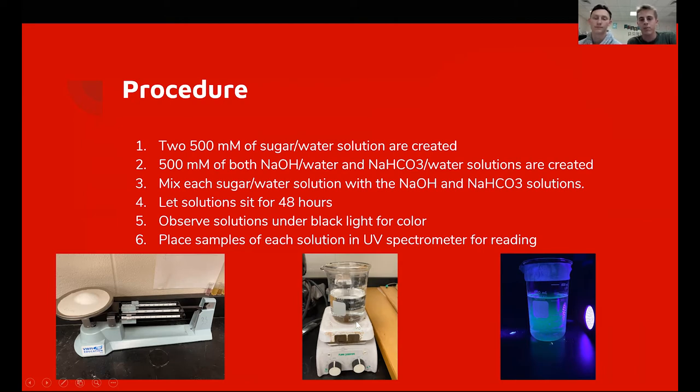And then we place each of these in 200 milliliters of water, and we mix them up to get a nice pure solution. And then we'll mix the two together, and then once we let it sit for 48 hours, you can see here when we shine a black light on it, it gives off a greenish tint. So based on the slide before, that means that this tint is showing a lower size quantum dot.